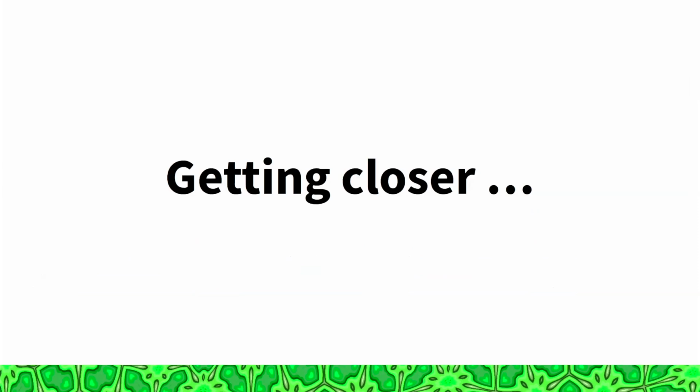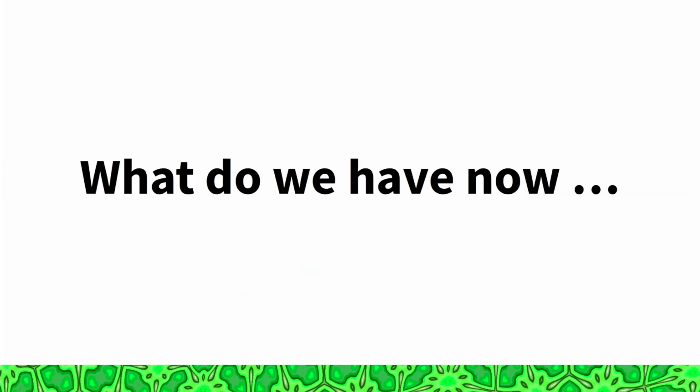So, as I mentioned in the beginning, we're just starting. It's been a few months, and I know that some of you who are on the call are continuously going to our site and seeing what's new. We know that we don't have all features yet, but we're slowly going towards that goal, and so we're getting closer. So let me just give you a brief overview of what we have at this very moment. At the end of this presentation, I will show you what we'll have in a few months.